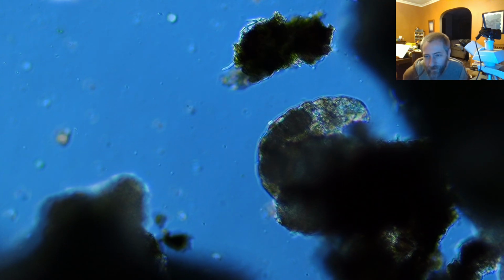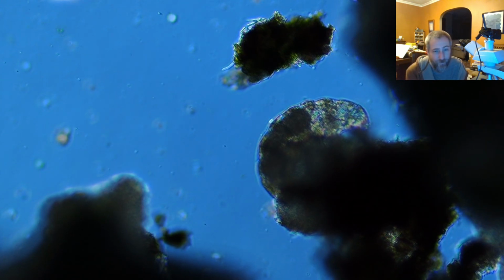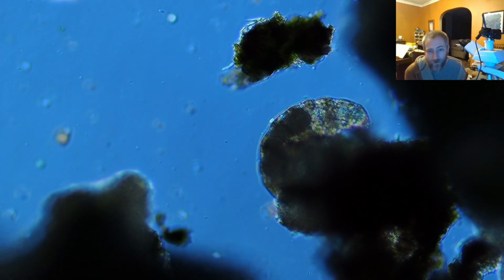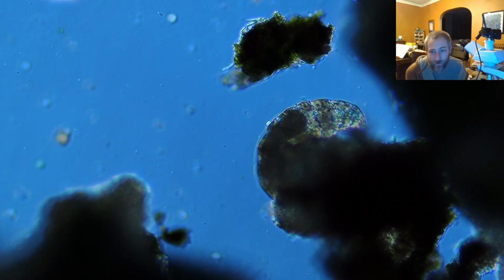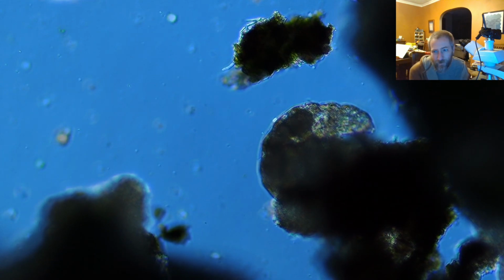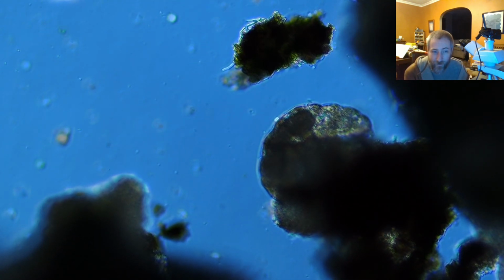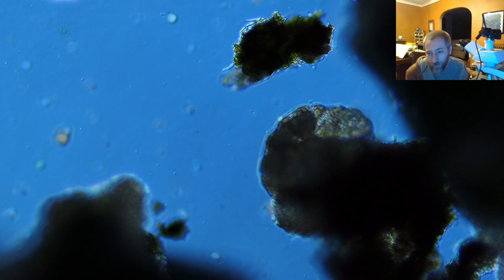Yeah, I don't know how people do this sort of stuff. With respect to finding them, they just go and sample all kinds of crazy environments, and that's how they find stuff. Similar probably to diatom work, where you're looking for diatoms living in weird environments. But they're larger than diatoms, so in a sense, maybe they're a little bit easier to find. You could take a field microscope with you.